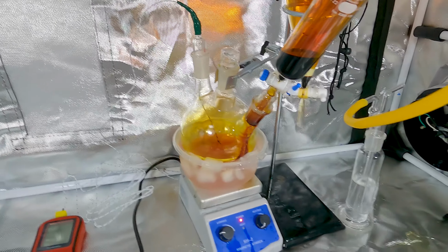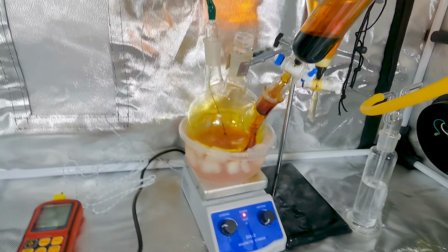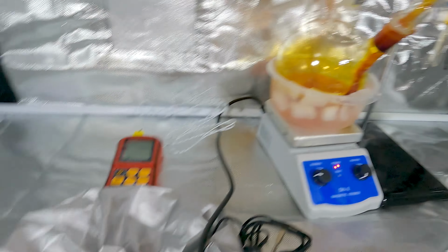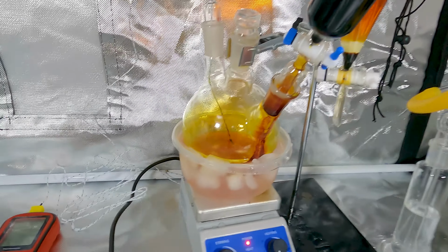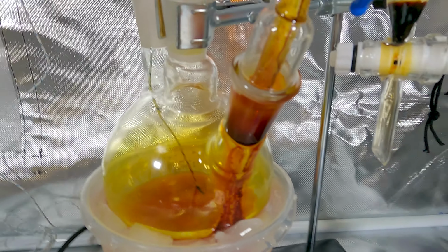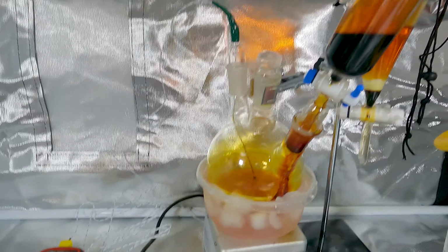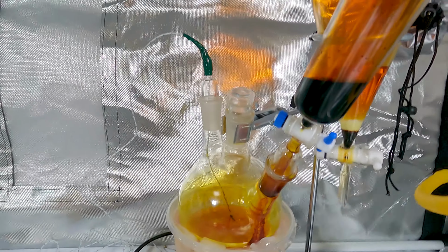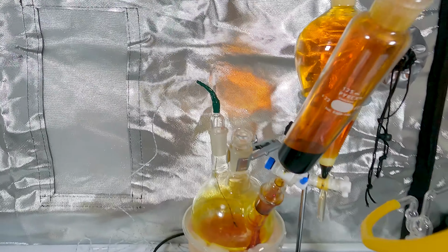Okay, we are slowly dripping some bromine into our dioxane ketal mix. We're trying to maintain temperatures between 10 and 15. Play it on the safe side. It's an exothermic process. You can see it going up there. I have it just barely open, I can't even see it in person, so now you can see it on camera, but I basically just have the tiniest little opening so bromine can kind of do its bromine thing and just sneak on through a little bit at a time.